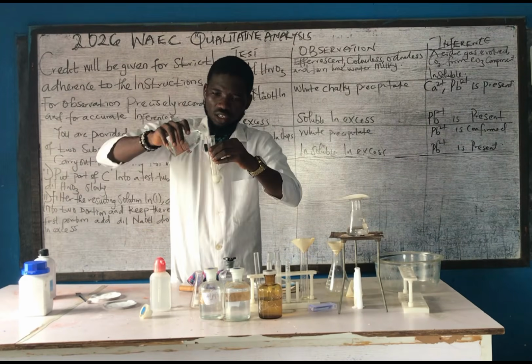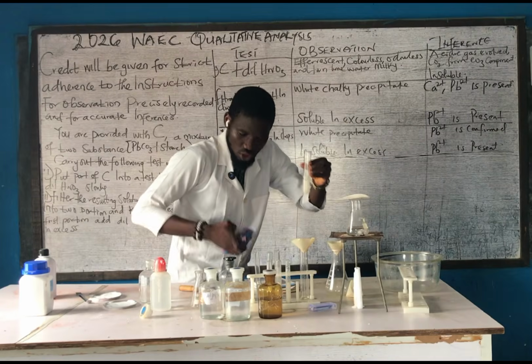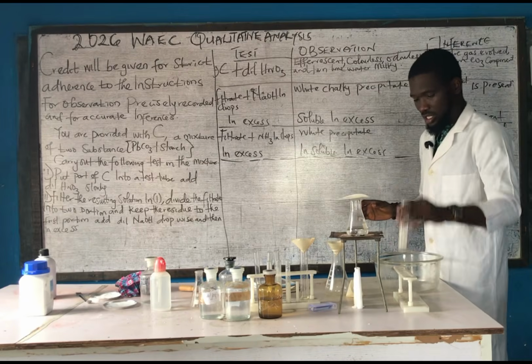As you can see, either in drops or in excess, I'm going to heat this.